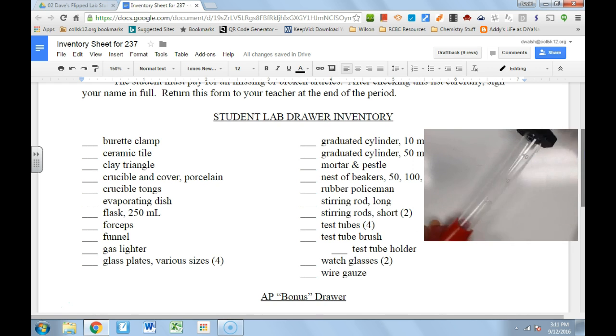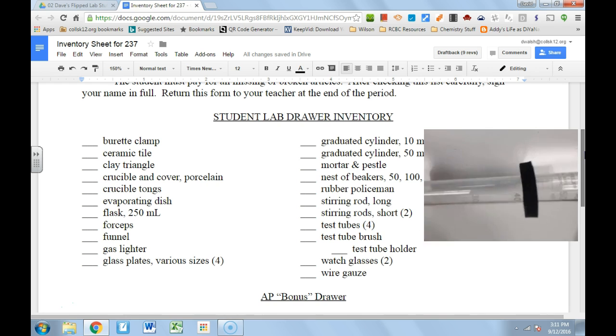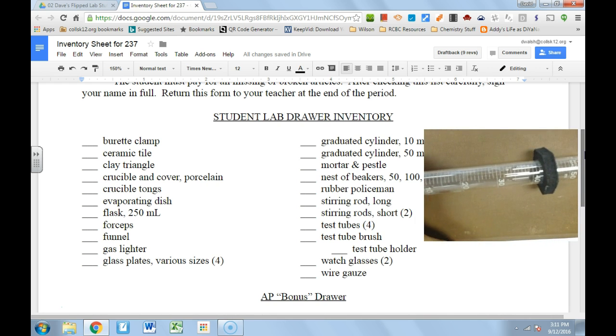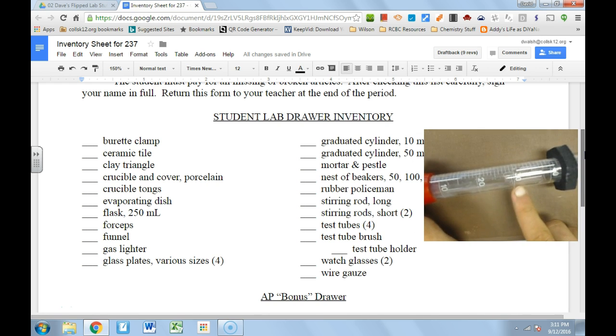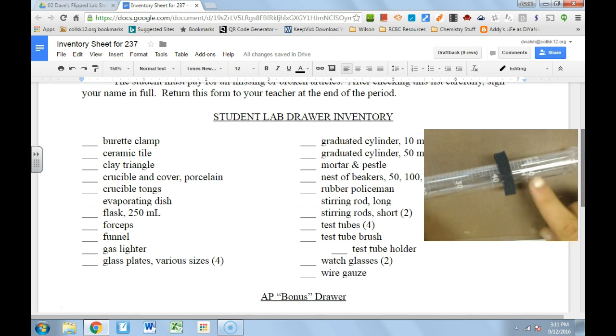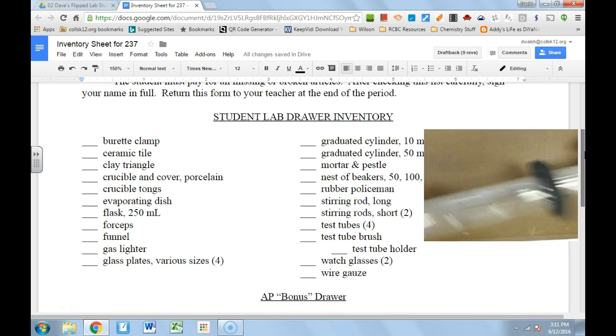Coming up next is our graduated cylinder. This is a 50 milliliter graduated cylinder. As its name might suggest, it has graduations on it — 10, 20, 30 milliliters marked all the way up to 50 milliliters. In between are ticks or graduations so you can accurately measure how much liquid you have.